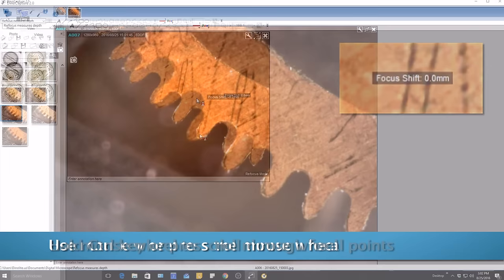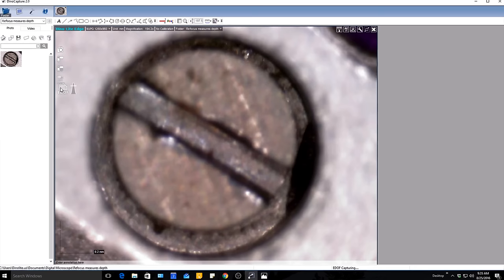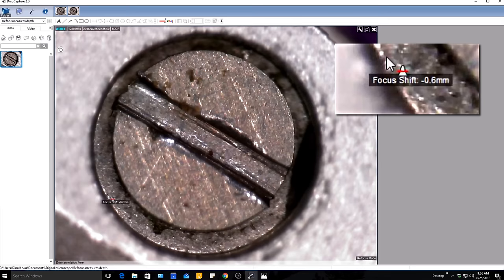Turn the scroll wheel on the mouse to cycle through different focal points. While holding the control key, you're able to view an estimated reference of depth between the highest focal point and the current location of the mouse pointer.